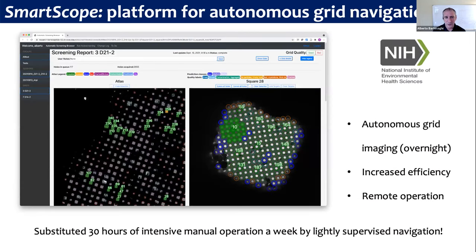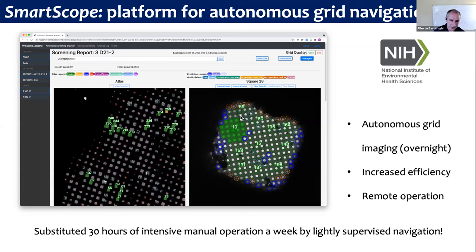We put all these tools together into a web-based user interface that runs on the microscope itself, with all feature recognition and classification running in real time, 24/7. This provides the information the microscope needs to navigate to the relevant areas on the grid. SmartScope has saved a lot of time in the facility — it has essentially substituted almost 30 hours of intensive manual screening per week by an operator sitting in front of the microscope. Now we have lightly supervised navigation that can run overnight, allowing remote operation and greatly increased efficiency.